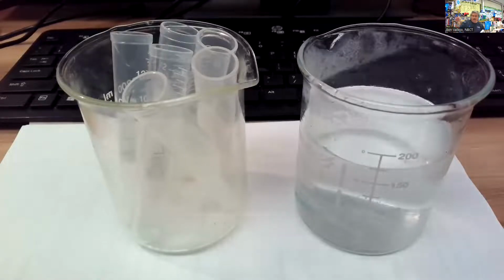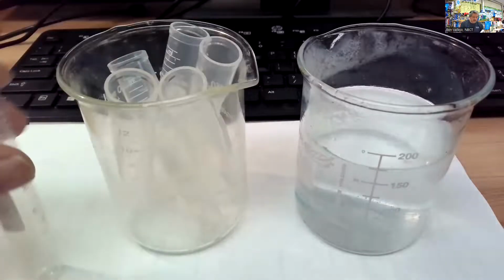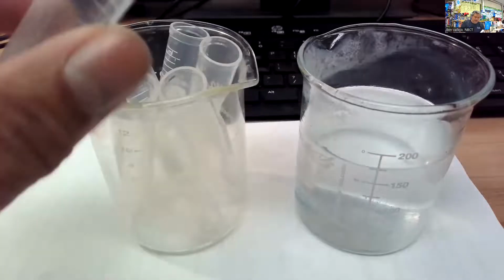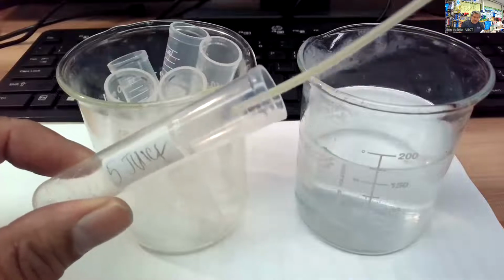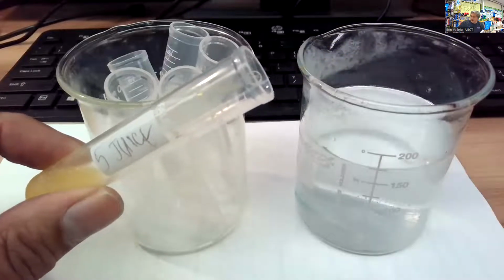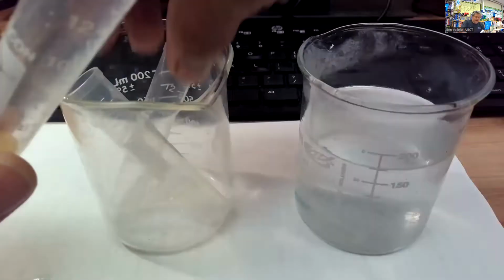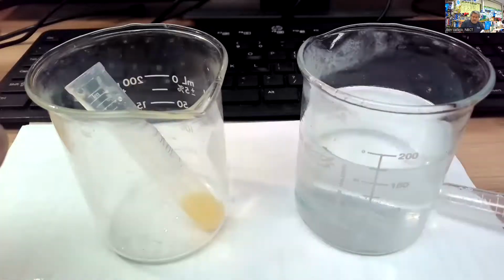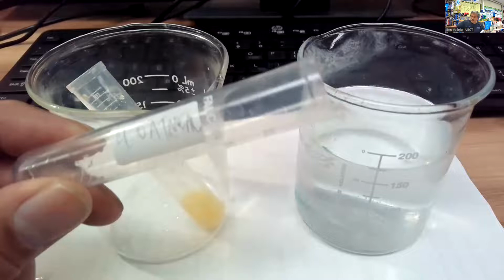So I have over here the juice. Let's see, I'll just take these out and put them in the beaker as I do all that. So here's the juice right here. So there's that one. Take these out. Here's some juice. This will be the oatmeal solution.